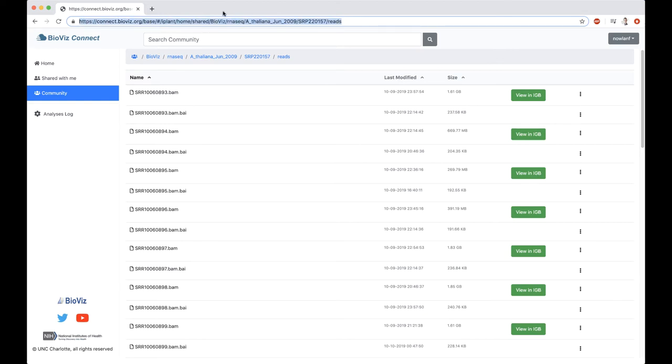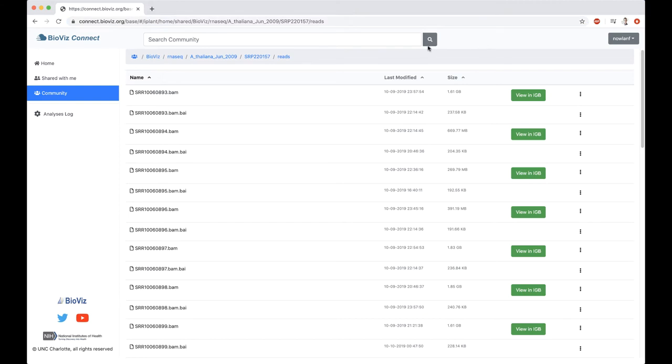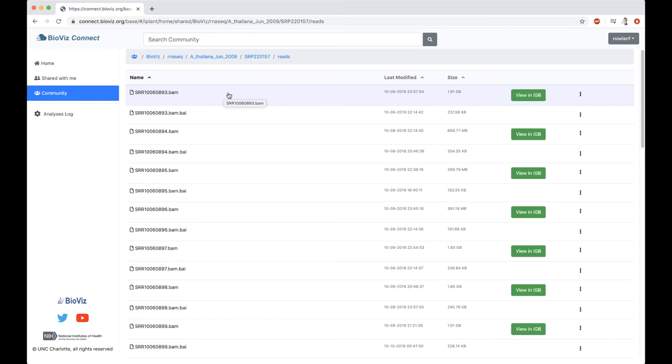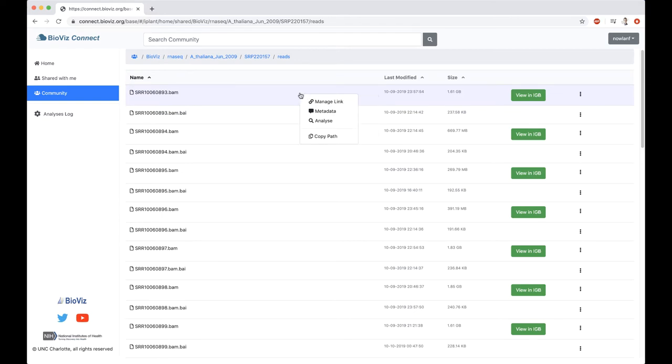As long as you're logged in, you can use these URLs. For instance, you could have a URL bookmarked if it was your favorite data set to jump to. In this case, we want to start off by looking at this very top file. This is SRR10060893. We're interested in comparing this file to another file.